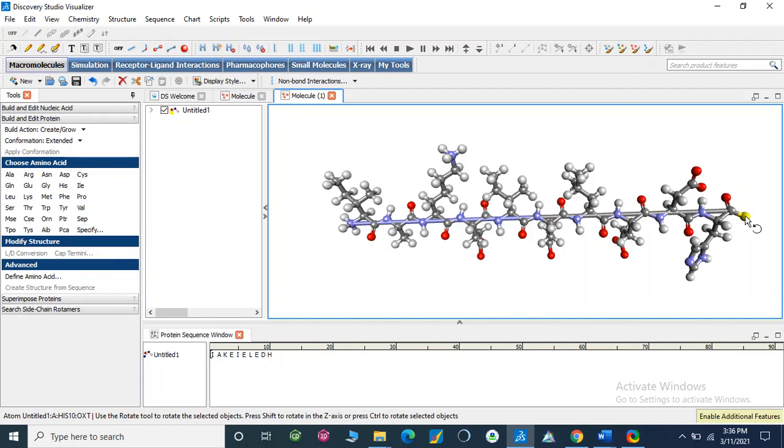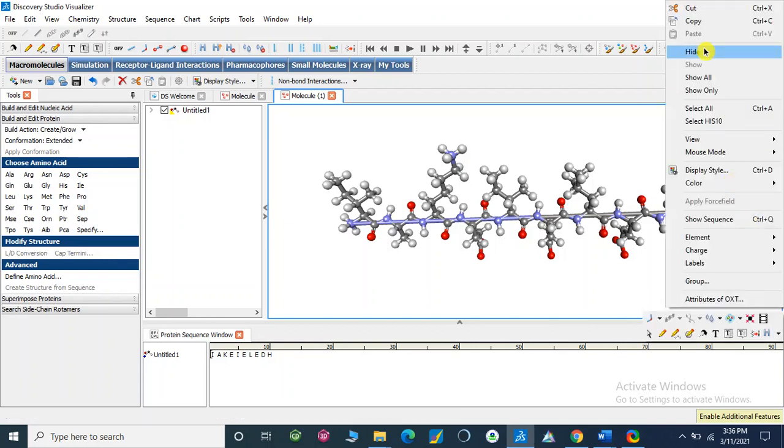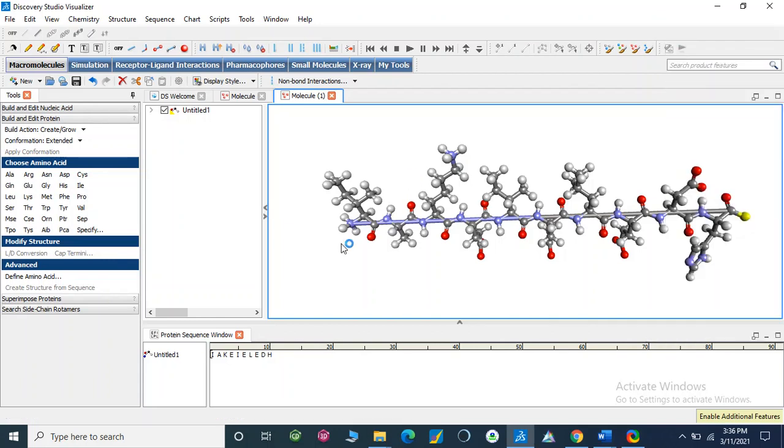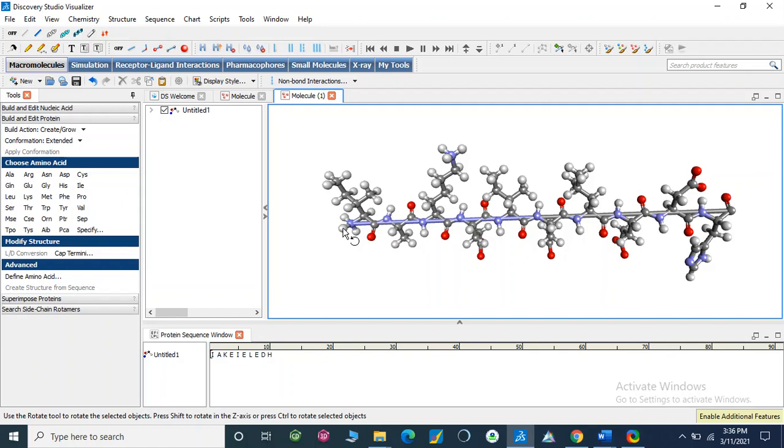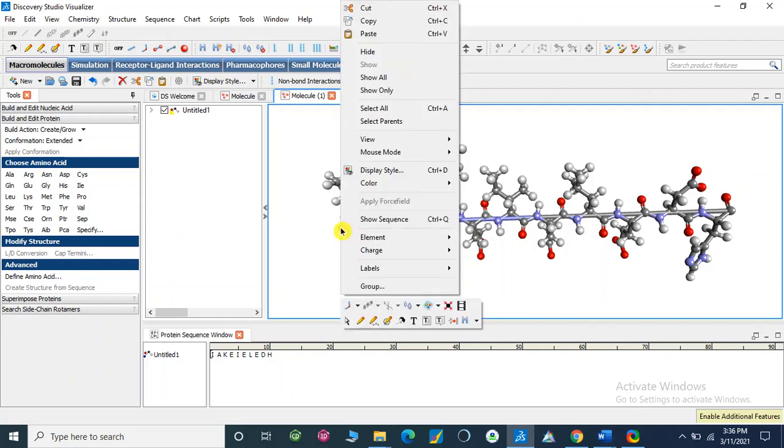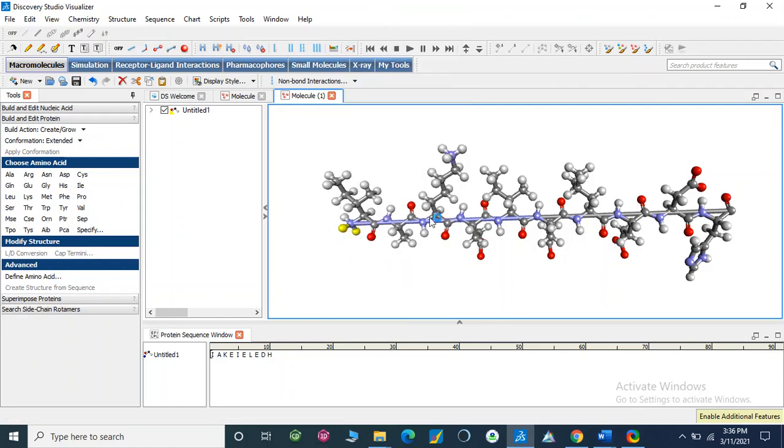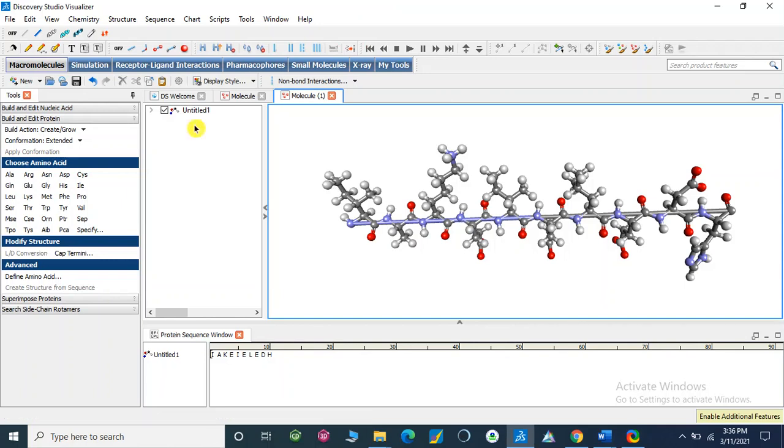From here, the water molecule is removed by making a peptide bond. So we will remove these two hydrogens. Okay, now select it.